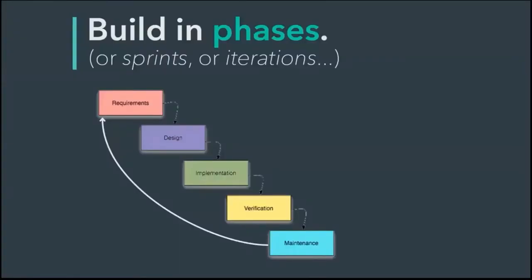And so when it was time for us to build a new screening work cell at Notable, this one was going to be our R&D work cell, we took the lessons learned from our previous build-outs and decided to develop this one in phases. The 5 steps that you see here are all pretty typical steps for developing almost any system. You start off by gathering requirements. What does this system need to do? You design your system. You build it.